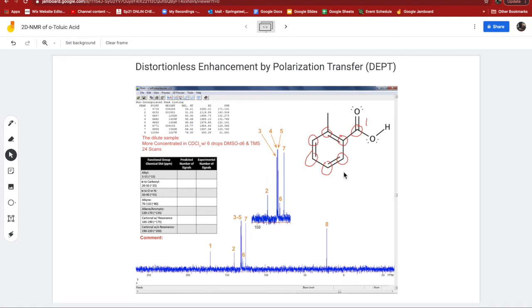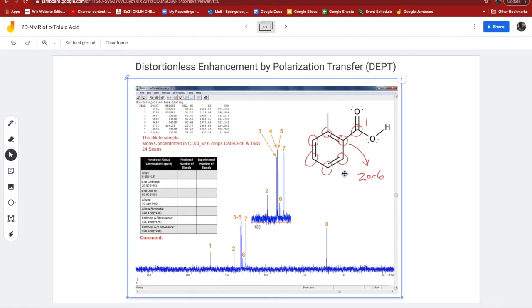So the carbons with no hydrogens, this one, that's going to be either signal 2 or 6, because carbons without hydrogens tend to be shorter. And then the other one here is also going to be 2 or 6. Let me make a guess at it. Let me see. 1, 2, 2. Yeah, I'm not sure. Yeah, those ones are close. I don't know.